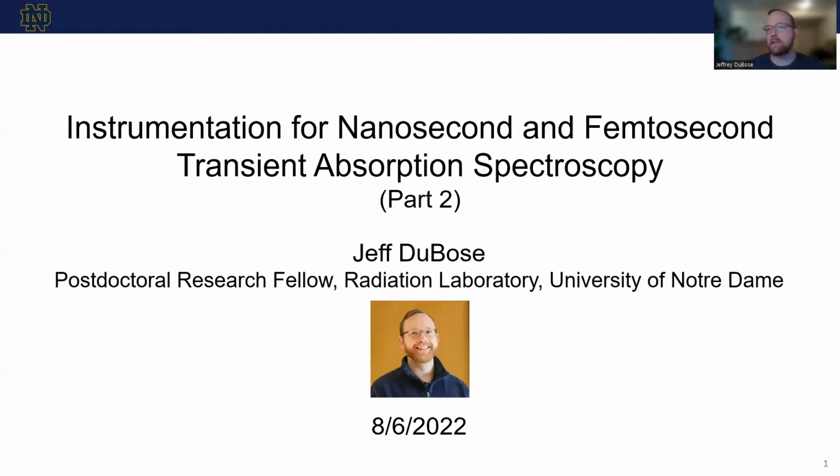So if you've missed that video, or if you're not as familiar with transient absorption, I would definitely recommend looking at that video first to give a pretty good basis of why we're doing these types of measurements, because this video is going to be a lot more on the instrumentation and the schematics and how we actually generate transient absorption spectra. So with that, let's just jump into things.